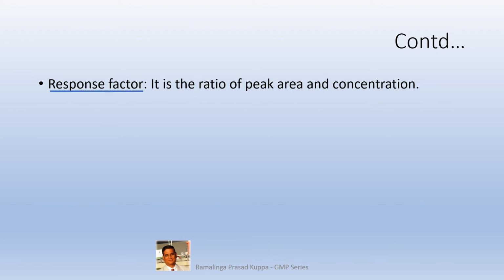Response factor. It is the ratio of peak area and concentration. To understand easily of RF, the response factor, it is the area per unit concentration in mg per ml. So total area divided by the concentration, you get area per unit concentration.